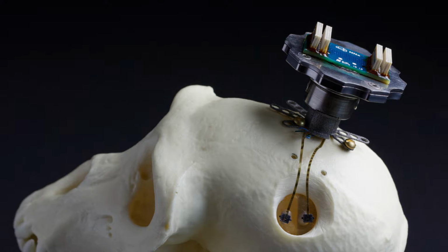So we actually developed a tool that is based on a torque wrench, so that you torque it to a certain point and then it won't allow you to over tighten it. And you know that you get sufficient compression. And I'll show you that tomorrow. That's not an absolute requirement. It's just a little bit of a safety net so that you don't accidentally, by default people tighten it. It's like, well, it might not be tight enough, so tighten a little bit more. And you don't want to over tighten it.